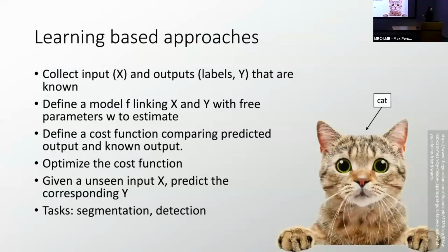In what we call traditional shallow learning, we often compute some features, so we don't use the direct image; we compute some features, and then we try to predict some label using a model. When we talk about deep learning, often we don't have this step of pre-computing features. We just let the training approach find the filters.